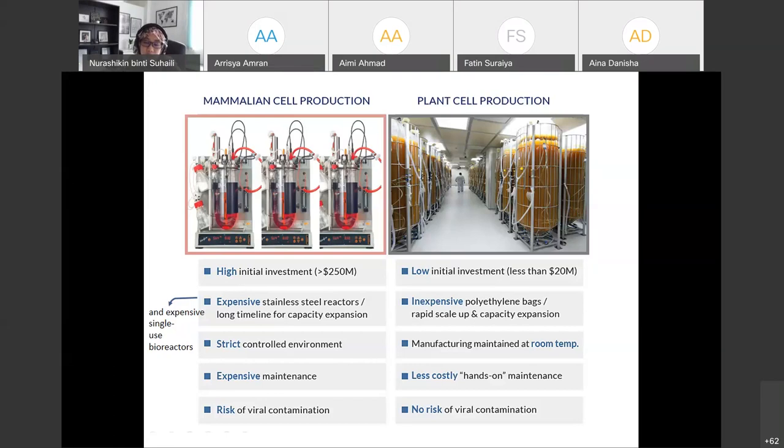Pounds, 1 pound is 5 ringgit or about 6 ringgit, 5 to 5.50 ringgit, it depends on the currency rate. 300 times 5 is, let's say, 1,500 ringgit for every experiment that I did when I was in the UK. So you can see how expensive it is. Just one experiment is 1,500. If you compare with a recyclable reactor, you just invest in the cost one-off. You don't have to invest every single time.